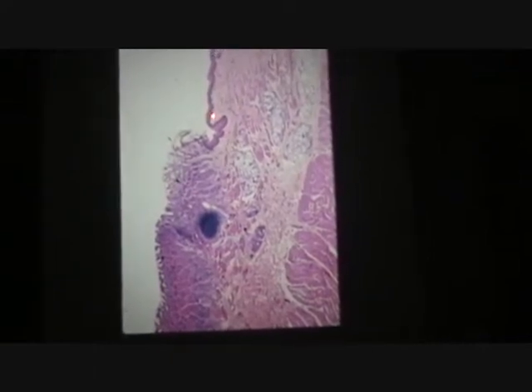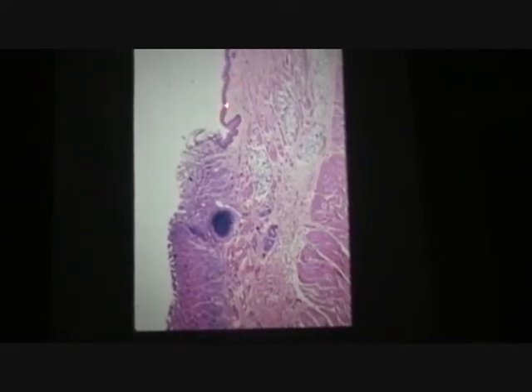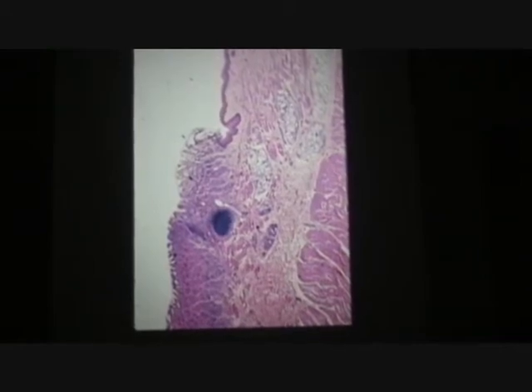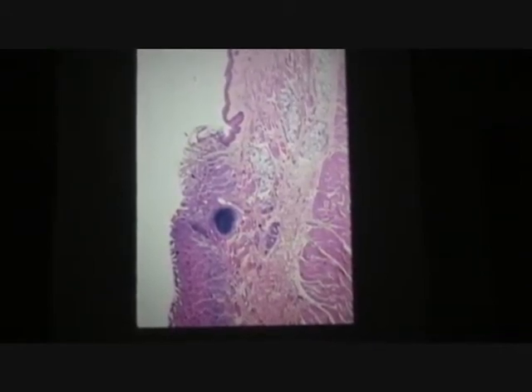And if you really magnified on this, you'd see just a little layer of stratified columnar in some specimens. You can see that, you go, oh, you got Barrett's esophagus mentioned in lecture on Monday. It's just a little cellular feature that you find in some individuals where it transitions and now can be somewhat unstable for mitosis.